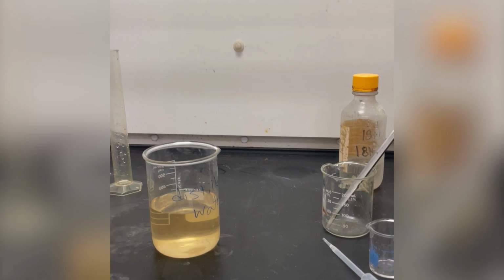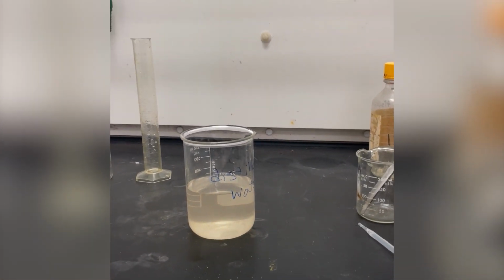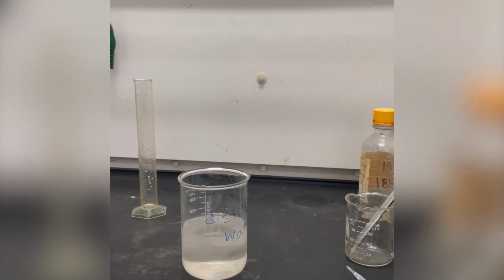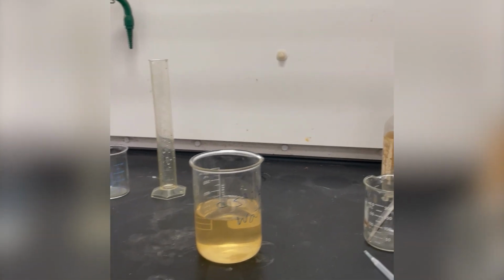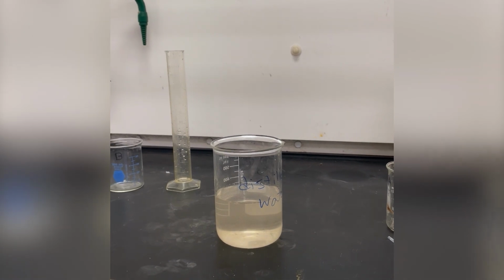In our experiment, we saw oscillations between a colorless and amber solution, but not a deep blue one. This is because of excess chloride ion concentrations in the solution from not using distilled water. From an article published in 1975, we discovered that a concentration of chlorine above 0.07 M would suppress the oscillations, but no reason was given.